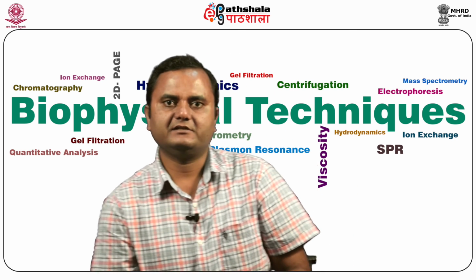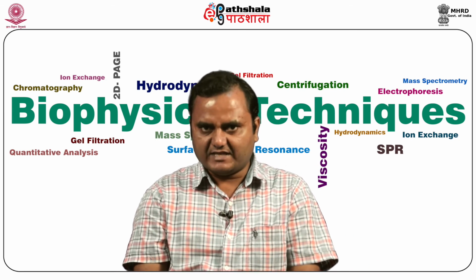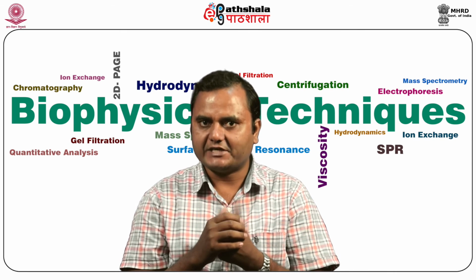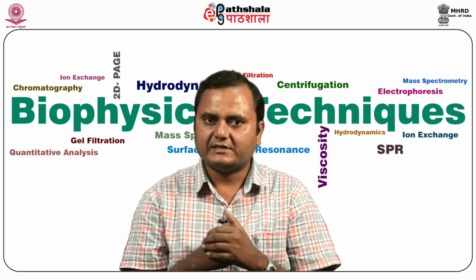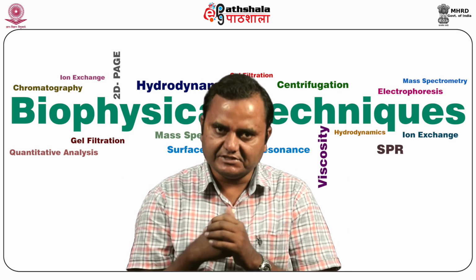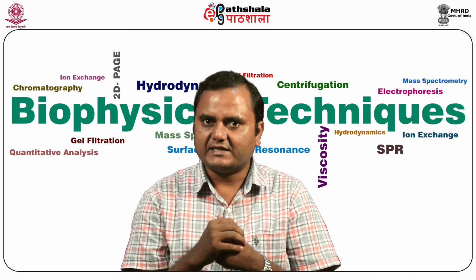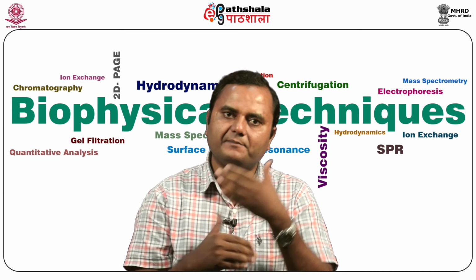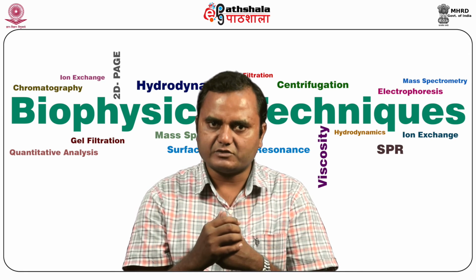Sedimentation velocity based method is used for the calculation of the biomolecular shape. Like if in a mixture you have different molecules with different shapes, that can easily be determined or analyzed using an analytical ultracentrifuge, and the method is based on the sedimentation velocity.